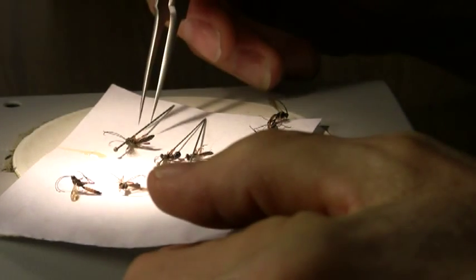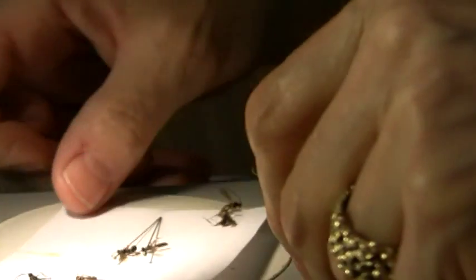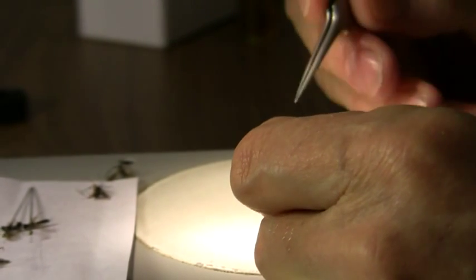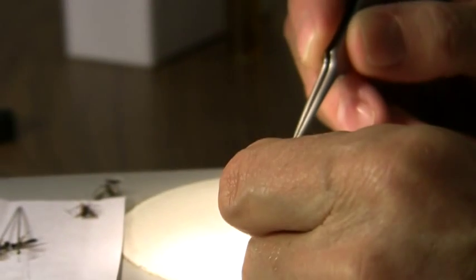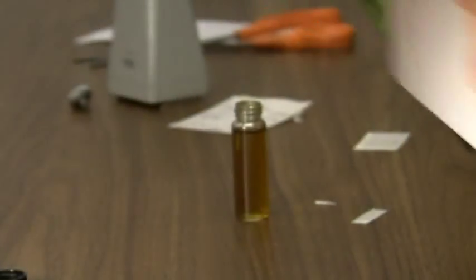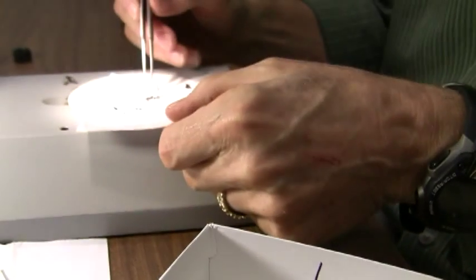And then by now we can go back to the one that we've already done and pick it up with the forceps, and then do the final adjustments under the microscope. We can have a look at it. The glue should still be fairly tacky. You can move it up and down a bit if it's droopy, but this one is just perfect. And once it's ready to go, you just set it in the tray here, and pick up another one that we've got over here.